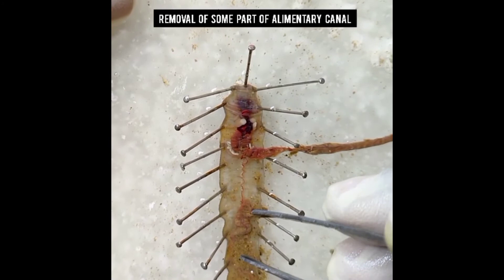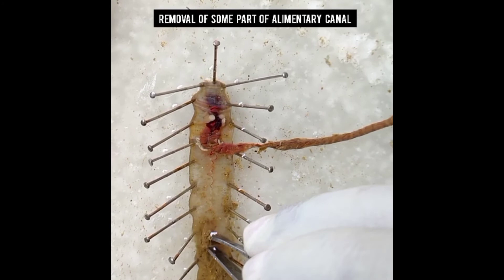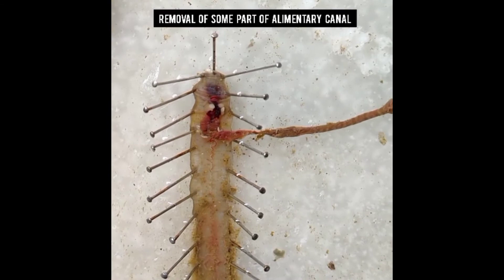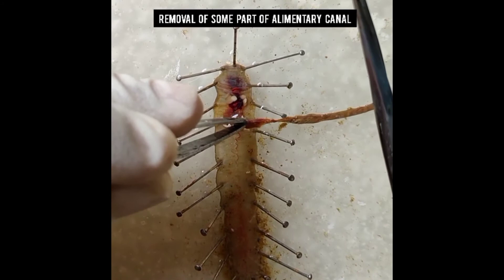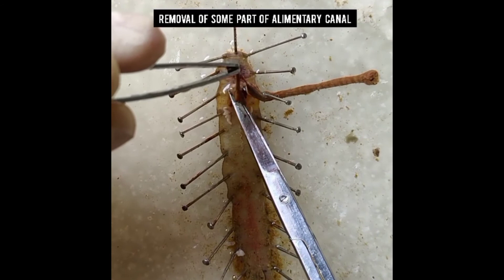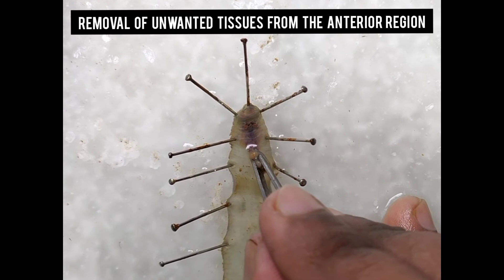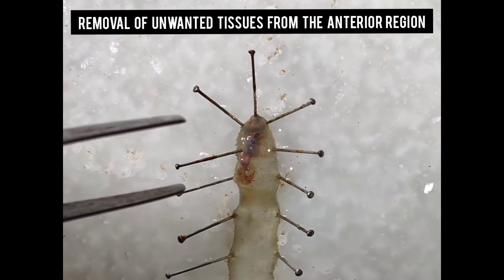The reddish thread-like structure is the ventral blood vessel. We'll remove the rest of the part gently. Now we'll remove the other unwanted tissues. We'll carefully dissect the nerve ring and cut the extra tissues with the help of scissors.